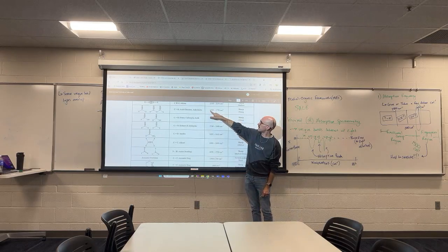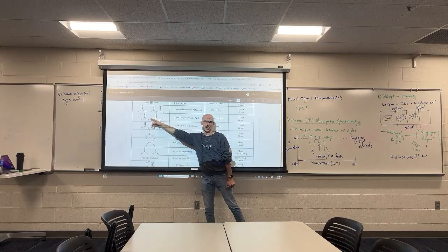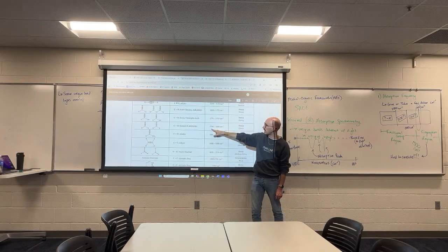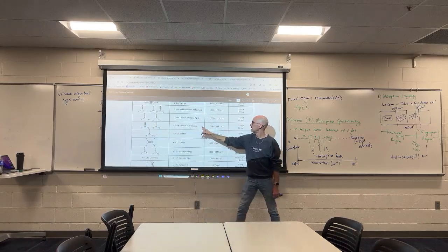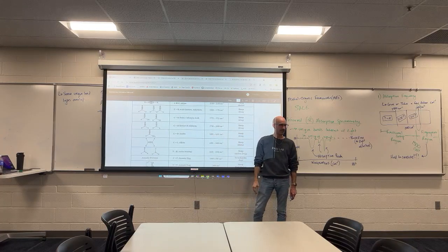Not to mention, this range comes down to 1770, which means it overlaps a bit with this next range, which starts at 1775. And that is a shared range between carboxylic acids and esters. And that range overlaps quite a bit with this other region that starts at 1740 that shares aldehydes and ketones. And that range overlaps a little bit, 35 wave numbers, with the region for amides.